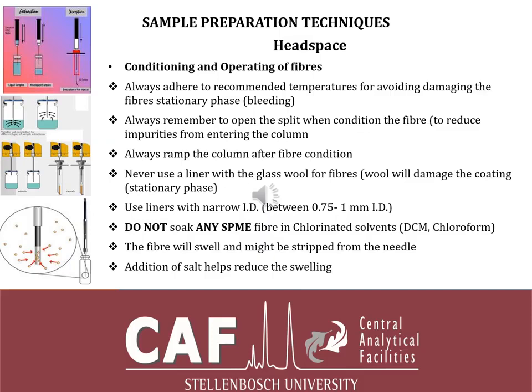So it is important to condition the fiber before using it. When one purchases the SPME, in the box in which they are inserted, there's also information on how to condition and precondition the fiber, and what to do and what not to do.